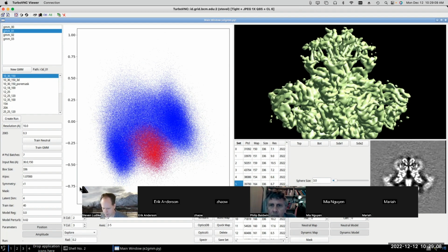So if you put in a bunch of particles all in different random orientations, then the Gaussian mixture model is mostly going to be spending its energy on trying to get the orientations to agree with each other instead of looking at variations among the particles. So starting out with a refinement where you've put all the data in and you've determined some orientation for each particle that agrees in some fashion is an important entry point here.